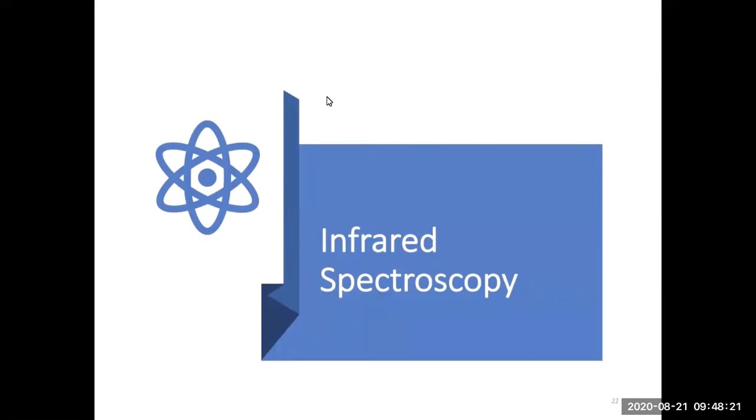This is the fourth video of our IR lecture series. In this video, we will examine 3 IR spectra and start practicing looking for main functional groups and matching structures.